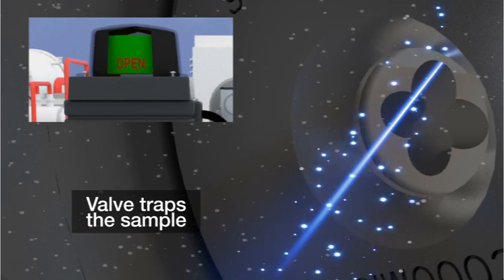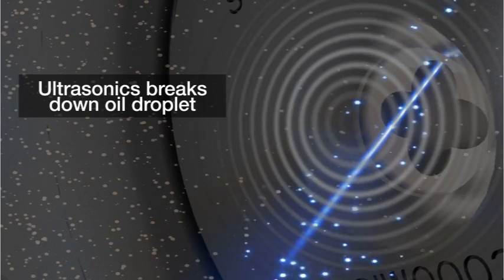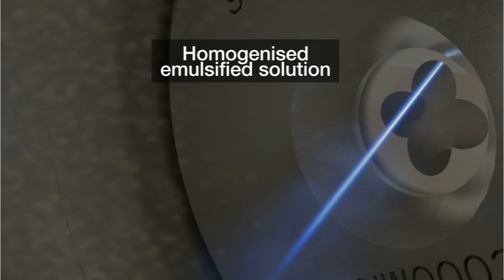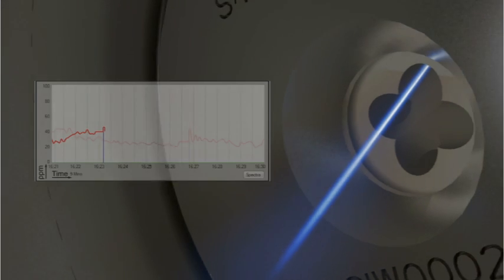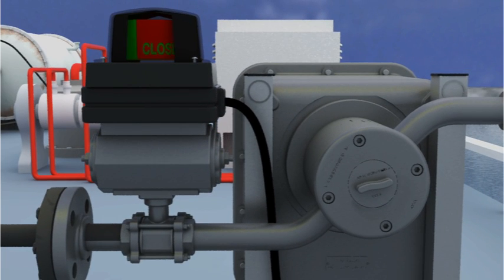Once the sensor has been cleaned, the valve traps a sample in the sample chamber and, using the ultrasonics, breaks down the oil droplets and leaves a homogenized emulsified solution. The PPM is then measured again and this value is recorded and can be used to compensate the real-time readings should oil droplet size be an issue. The valve then reopens and the measurement cycle starts again.